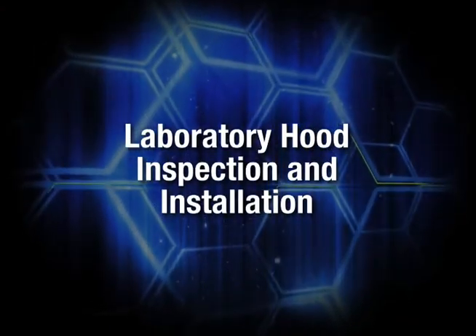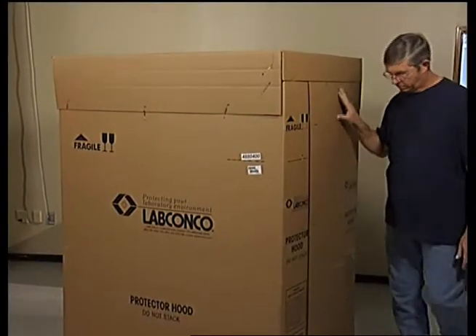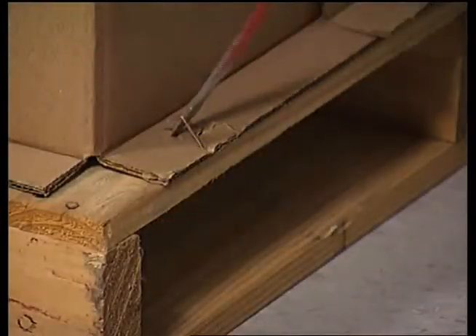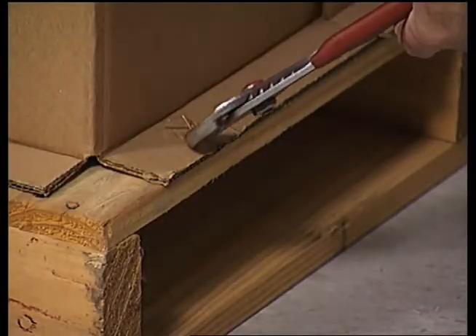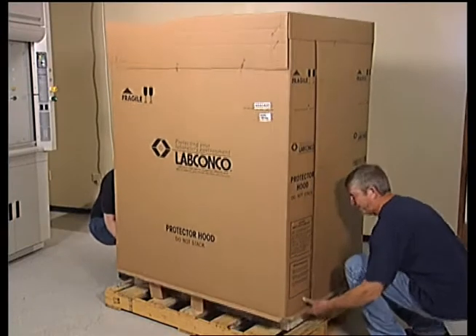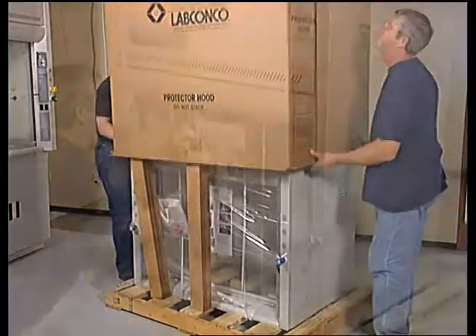As with the base cabinet, your Protector Premier hood and carton should be inspected and any damage reported directly to your carrier. Remove the staples securing the carton to the pallet. Remove the outer carton. Do not discard the packaging materials until all components are checked for damages.